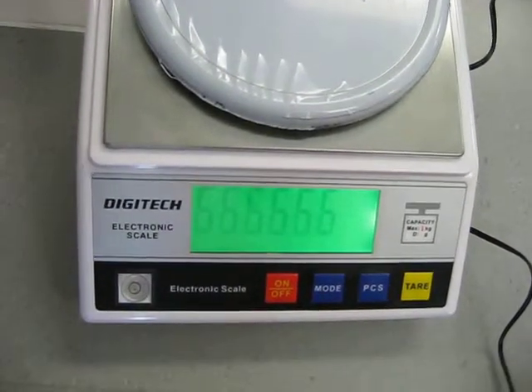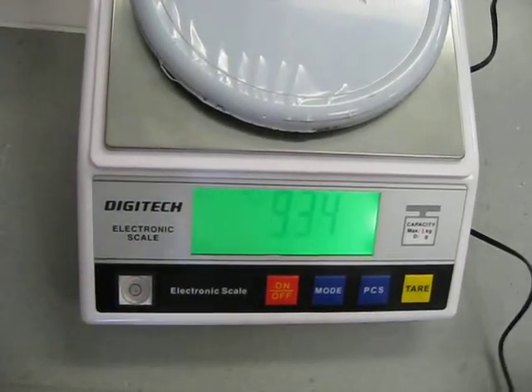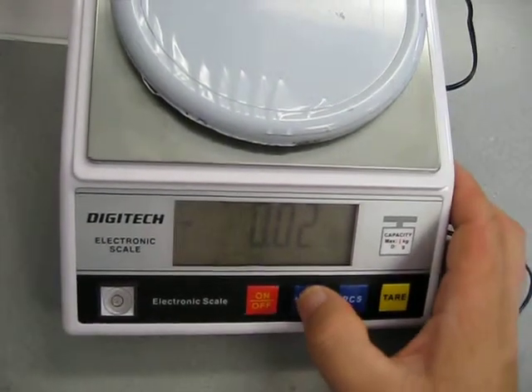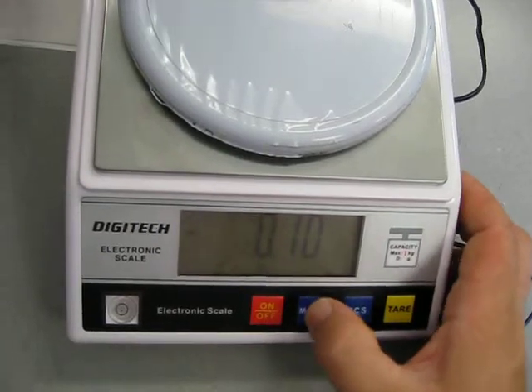You go through the numbers and freak out a little bit, then wait for it to settle. Once it's on, if you press mode, it will cycle through different units.